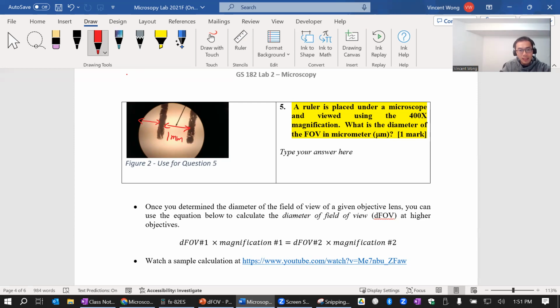And then there's a little bit here as well. So if I take this and add that together, everything put together across, how big are we talking about? What's the distance? 2 millimeters. Do you guys understand? They want it in micrometers, so I times 1,000.